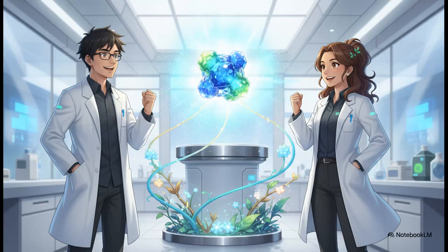So, to summarize our masterclass today, bioaffinity chromatography is without a doubt completely indispensable in modern biomedical science. By simply exploiting the beautiful, natural, biological interactions that already exist in nature, this technique allows us to isolate target biomolecules with exceptional, totally unparalleled purity. Its outstanding specificity is exactly what makes modern biotechnology, proteomics, and pharmaceutical development possible today.